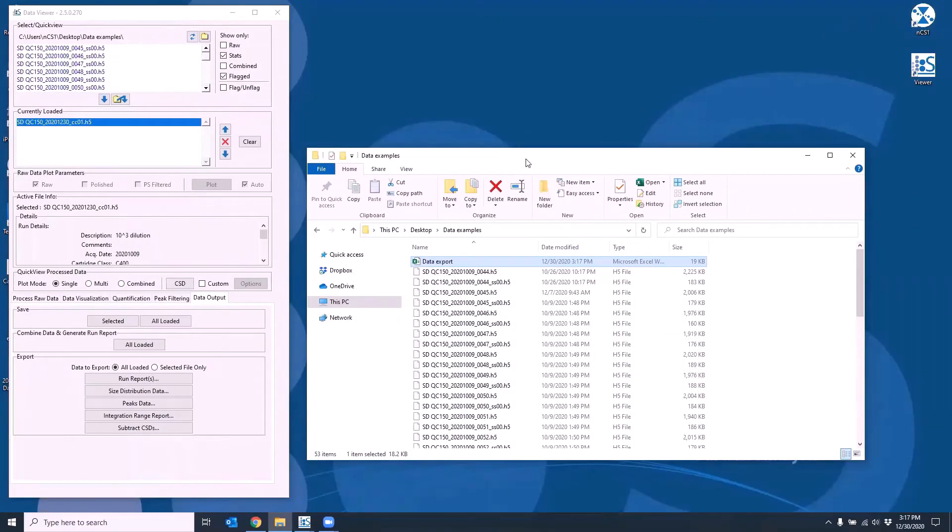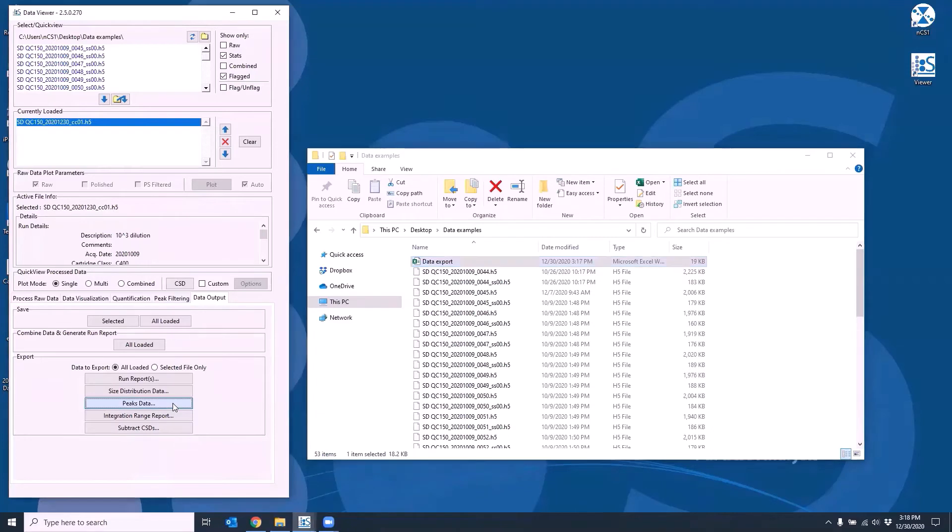The peaks and raw data option will export the parameters recorded for each of the detected events.